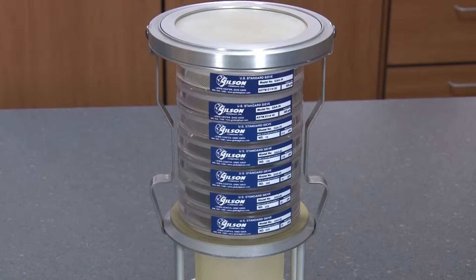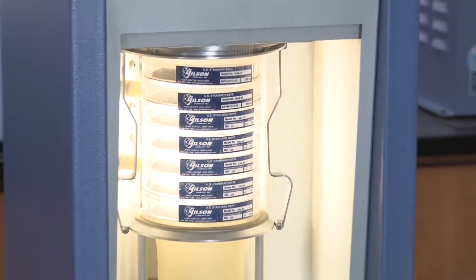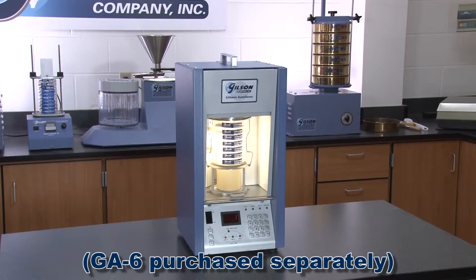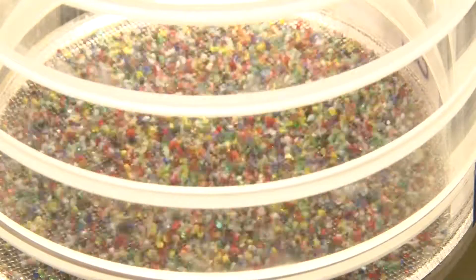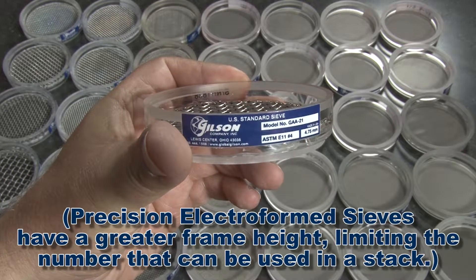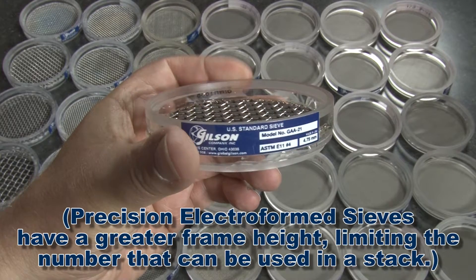The Gilson 3 inch acrylic frame test sieves are required for the GA6 Gilsonic Auto Siever and can be used with many other sonic sifters. The short stacking height of 0.8 inches allows twice as many sieves in a stack.